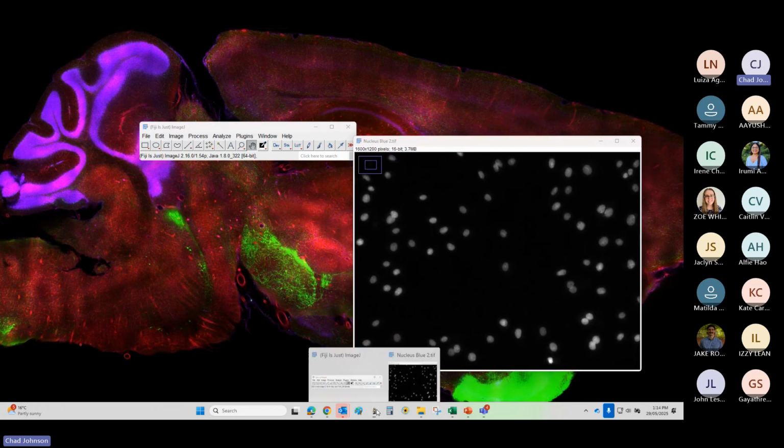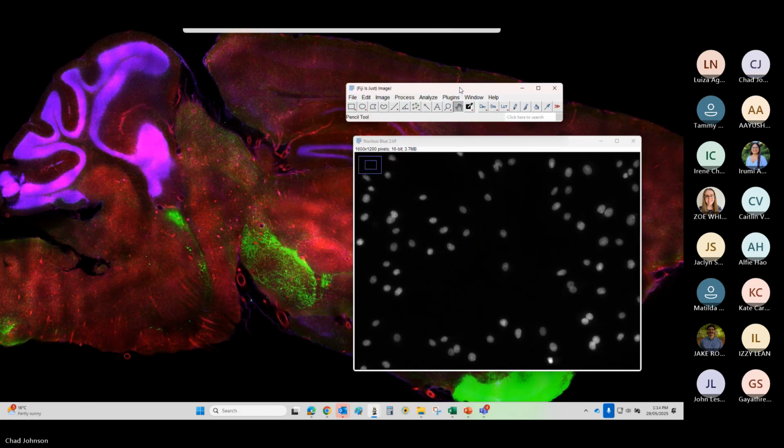On the top of the ImageJ window, you'll have data depending on the position, the value. In the top of the window here, you'll have display data. This image isn't calibrated, but if it was, you'd see the calibration data there. I can tell that this image is a 1600 by 1200 pixel image. It's 16-bit and it's this size.